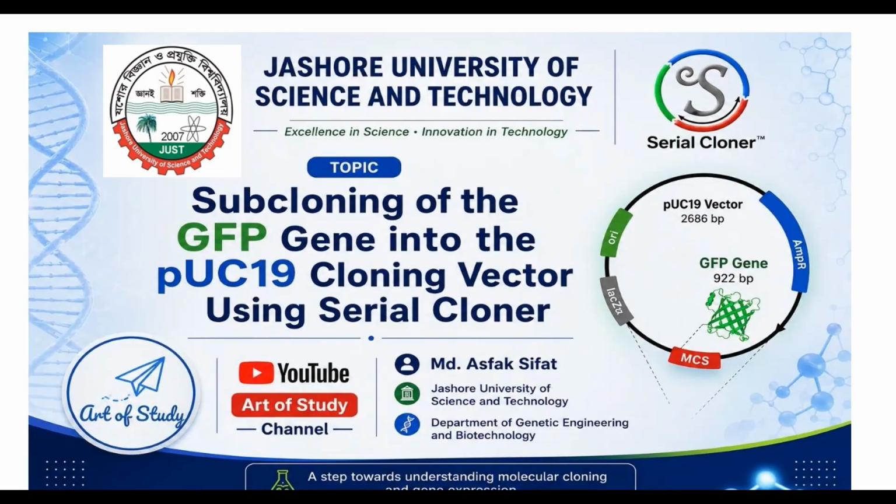Today we will learn subcloning of the green fluorescent protein gene into the pUC19 cloning vector. And here we will use Serial Cloner, a free software that we can use without internet connection.